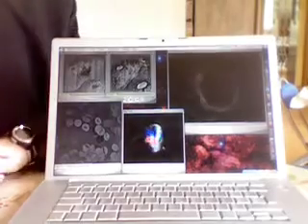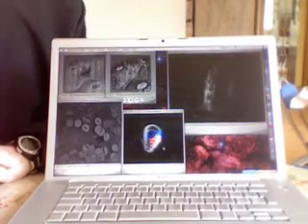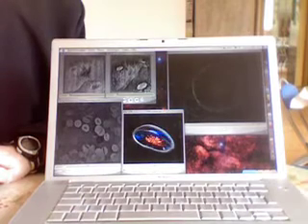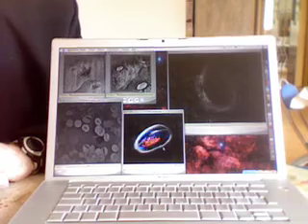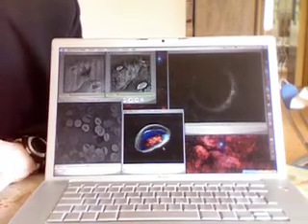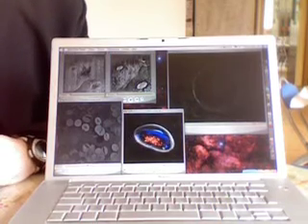So basically, these objects are transparent, and you can observe them with that microscope. Yes, that is really the idea: to try to observe natural objects without adding any dyes. Okay, it's very nice.